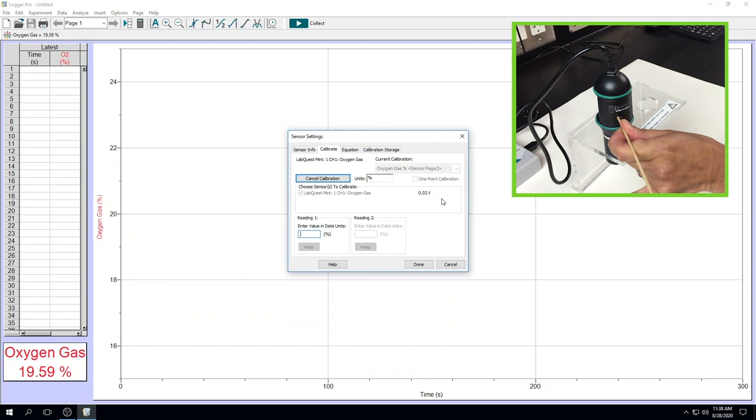It's okay if it's close to zero. In this particular case, it's 0.02 volts. That is completely acceptable. Under reading one, enter zero and keep. At this point, release the wooden stick from the oxygen sensor. You will see the voltage on your screen bounce back to the original volume.